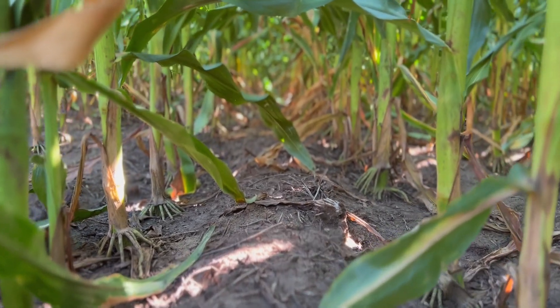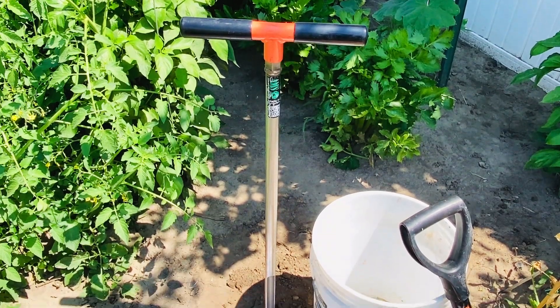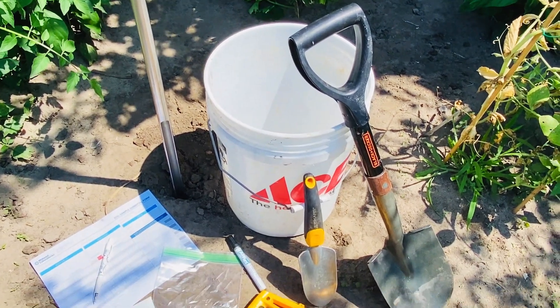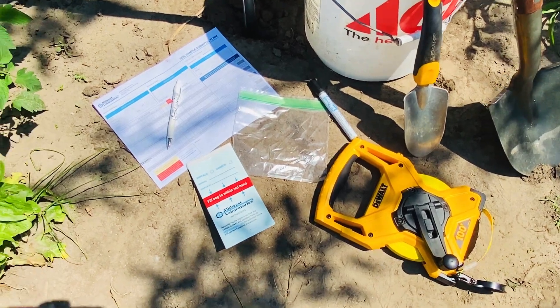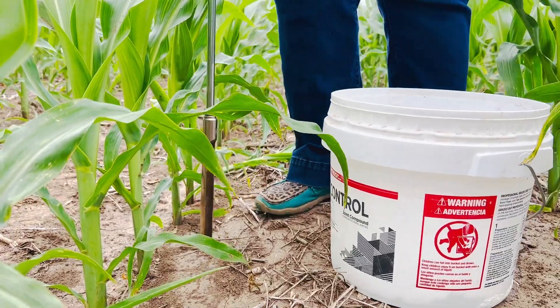It is ideal to decide on the tools you will use. Most generally, a metal probe is used to pull cores from the soil and a plastic bucket is used to mix the cores. Make sure the equipment being used is clean and free from rust that may contaminate the sample. Determining at what depth you will take the sample from is important as well.